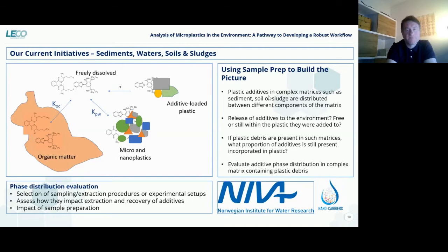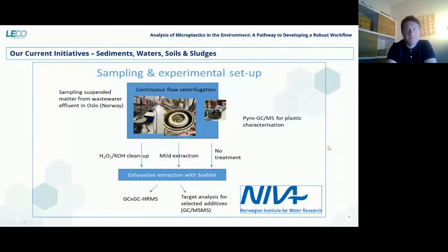So in order to have a workflow for this, and I think it was nicely described in the last talk, employing this PISA workflow and so on. This is something we're looking at with the Norwegian Institute for Water Research, and they have developed and are still developing various workflows. And of course, we keep in mind with the analysis procedure, the validation of these workflows is important, and that's where we come in, and we want to particularly be able to test each and every step.